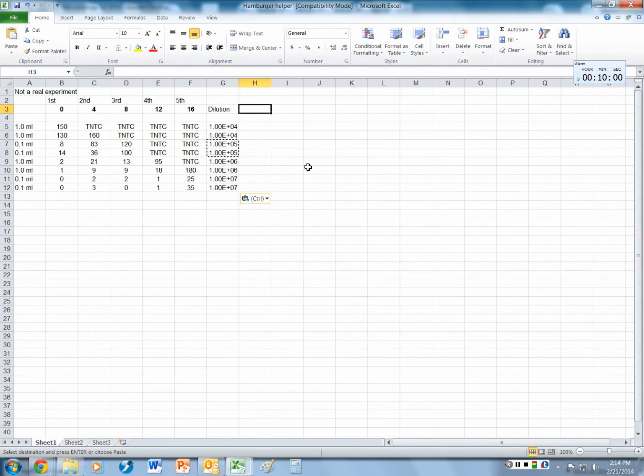So if you know what your dilution factors are and how much they vary from one another, and you see what a serial dilution does and what the pattern is, you can practice using Excel formulas to make your column of dilutions quicker. All right, you'll see there's a particular reason why I've listed them all here right at the end of the table. It's because the easiest way to do your calculations in Excel is not one thing at a time, but just to multiply the whole darn table and get the whole thing done.